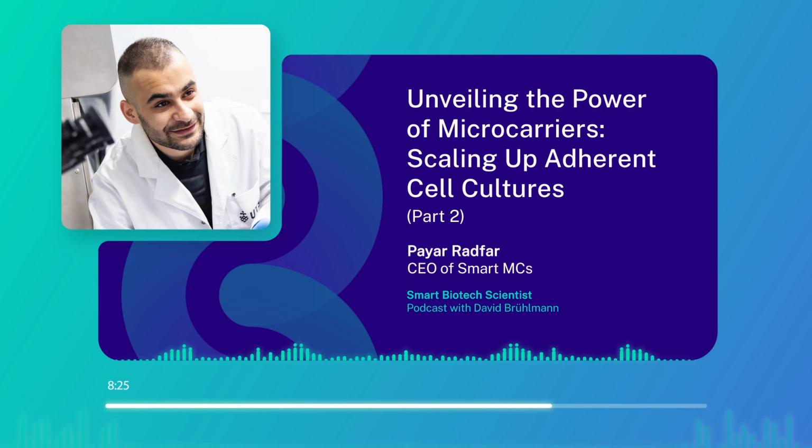It depends, at the end of the day, on what you're producing, your vaccine or your bioreactors, and how much you're spending on that. If media is costing you more, and that's 90% of your cost, maybe spending a little bit more on microcarriers and the bioreactor setup will balance itself out. And I think that's where we are seeing the trend as well. That is coming back, especially as you're showcasing that our microcarriers are pretty promising in the sense that they can overcome the limitations that have been existing.